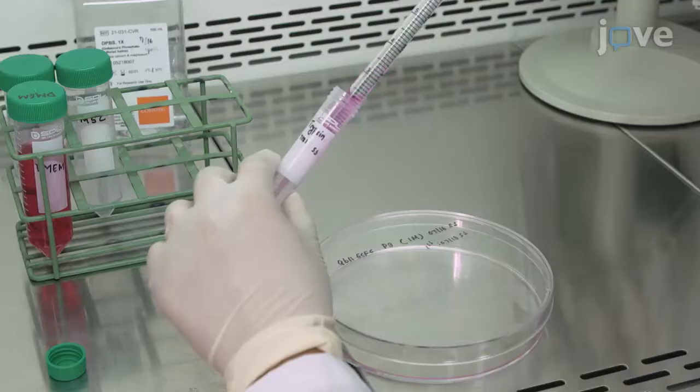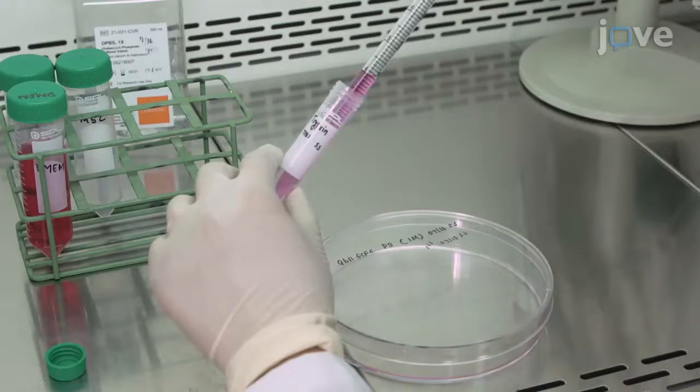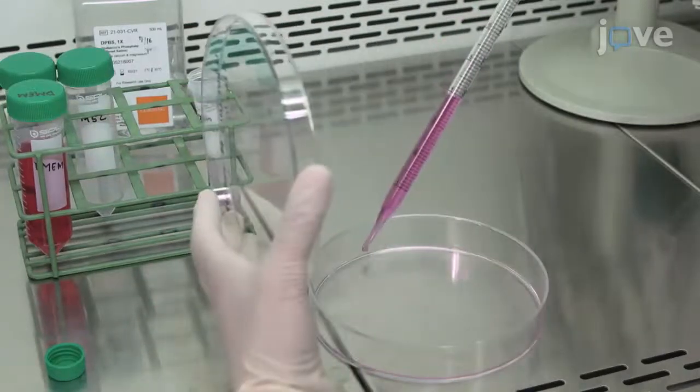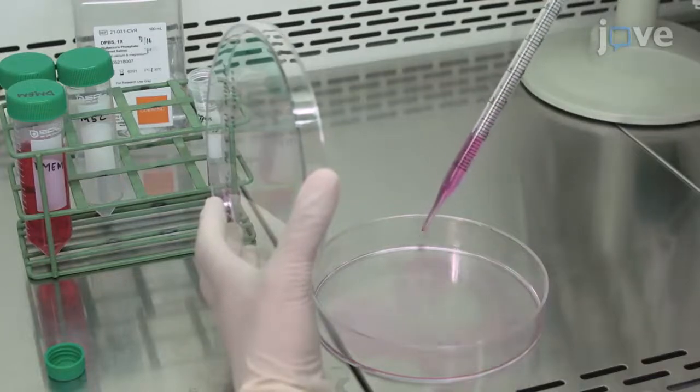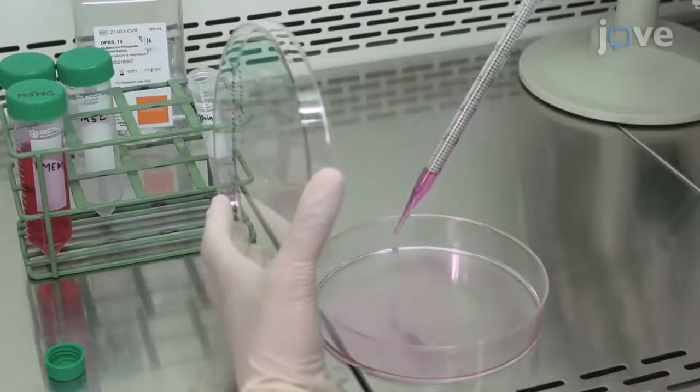Begin by using 0.05% trypsin EDTA to detach ECFCs and MSCs from 80-90% confluent cell cultures for 3 or 5 minutes in a cell culture incubator, respectively.